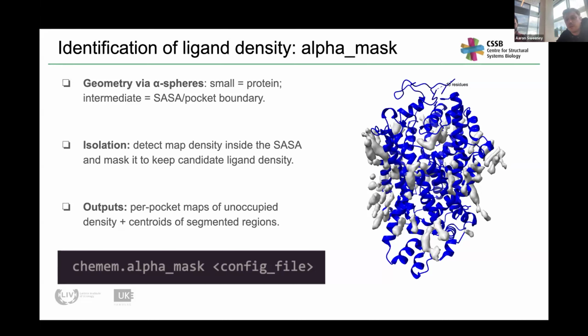I guess if you wanted to fudge it, you could add in an atom or two as an SDF file for where you didn't want it to be. I have never tried this, and then it won't move into that one. But yeah, I haven't tried it. I wouldn't really advise it. But maybe it could give you a starting point that you could then refine. Unless you can tease out the two conformations, I'd actually recommend going back to the maps and trying to get out both conformations.